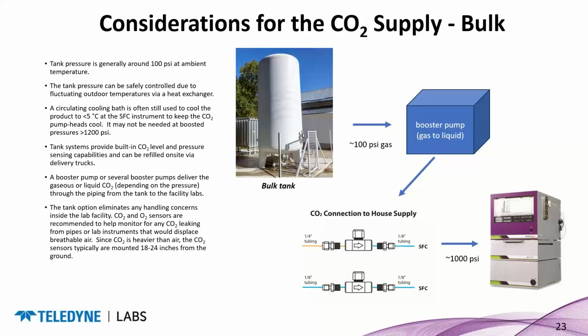Generally I recommend, with larger volumes, that you also add CO2 or oxygen sensors into your laboratory. CO2 is preferable because those sensors will react immediately to the presence of CO2. And because CO2 is heavier than air, those are usually mounted near the ground in your location.